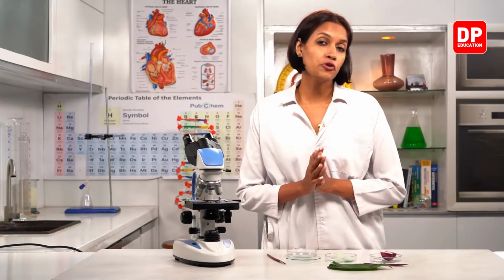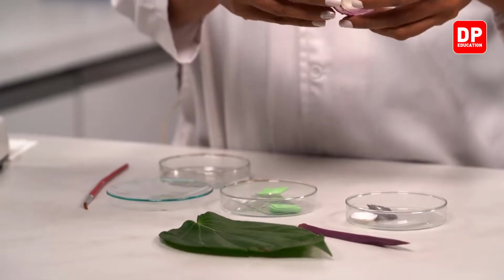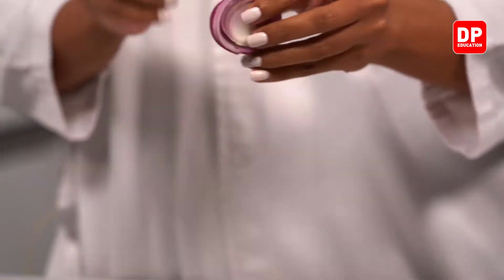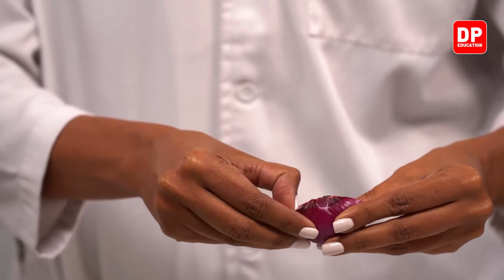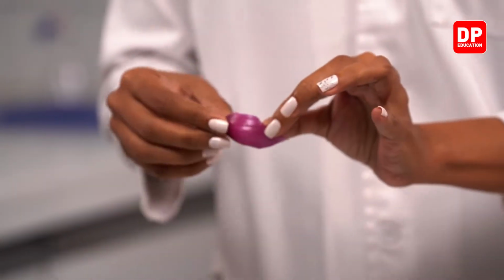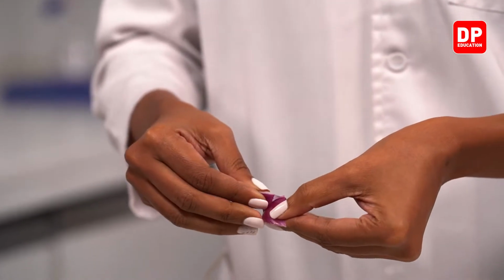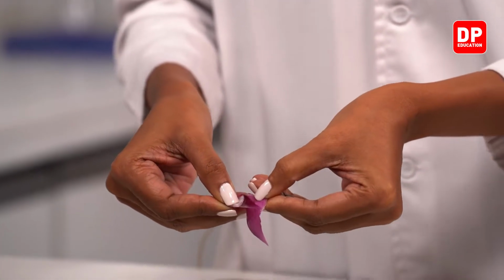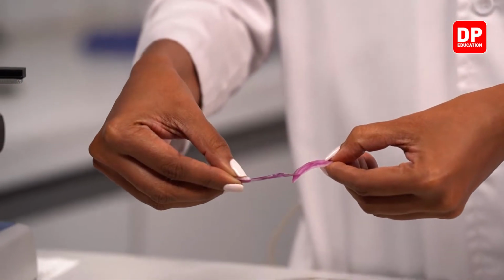Right. First of all, I'll show you all how to make a specimen using this onion peel. So we need to take a piece of onion like this, and we need to obtain a very thin peel of this one. So I'm going to take a piece like this, and I'm going to break it like this, and there we can obtain a peel very easily, right?